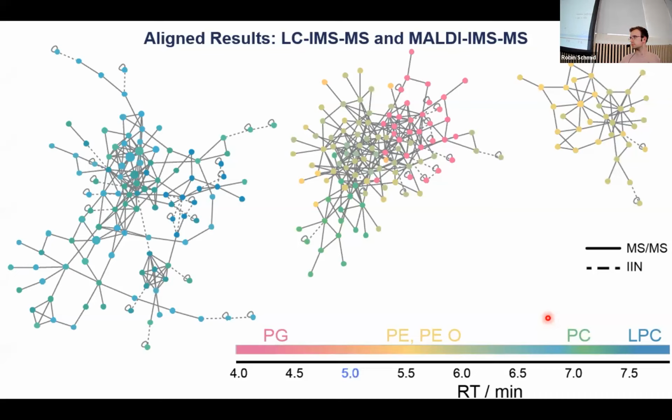It's not super established methods. All the labs are still developing methods to handle even smaller sample sets, like the 88 samples that we did today on all your little laptops. It's way harder to do that with 88 timsTOF files because they are massive.